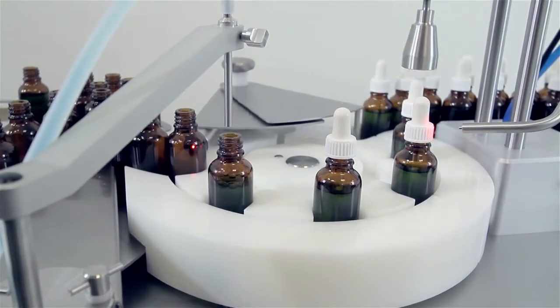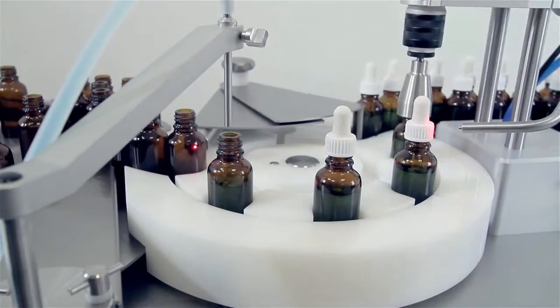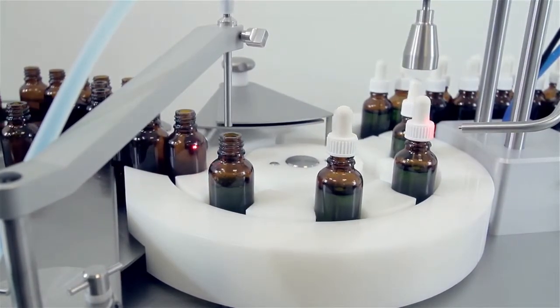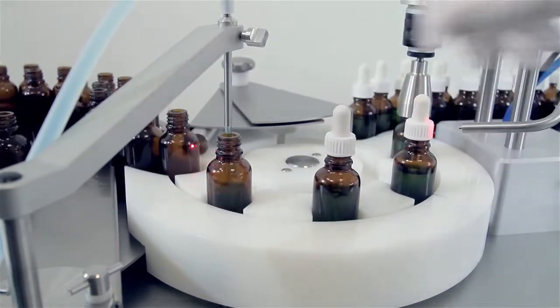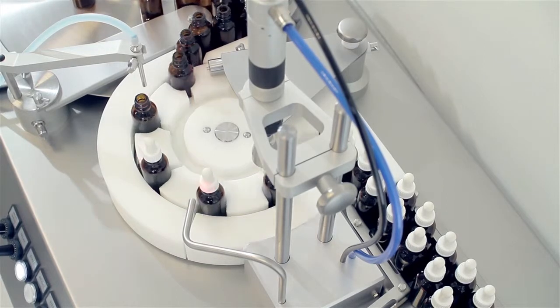The FlexFeed 30 meets the demands of flexible, small-batch production while delivering a consistent production quality that is not possible with manual filling and capping. It delivers an excellent return on investment when upgrading from manual filling and capping solutions.